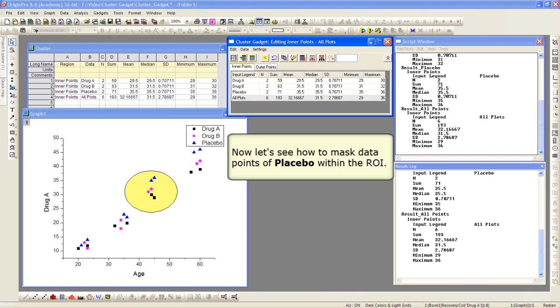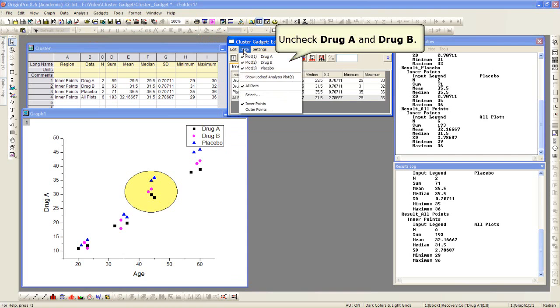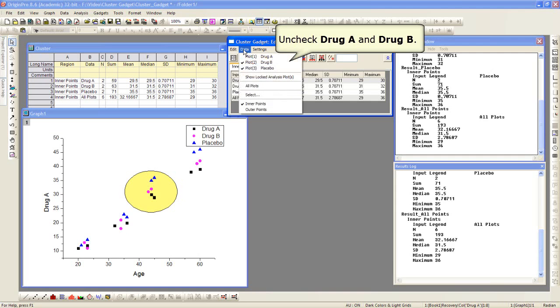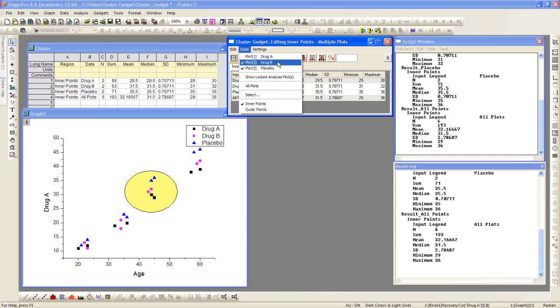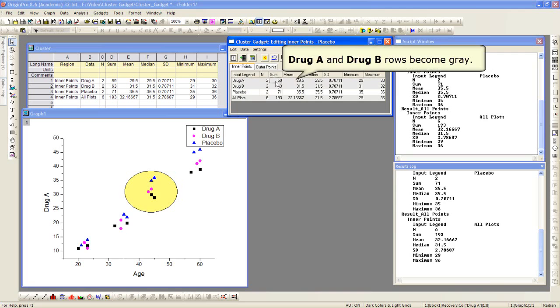Now what we're going to do is mask the placebo data points within the ROI. And to do that, you use the mask functionality within the cluster gadget itself. The first thing we need to do is uncheck drug A and drug B. We're only going to be working with the placebo data. As we uncheck, notice the rows in the table inside the dialog become grayed out.